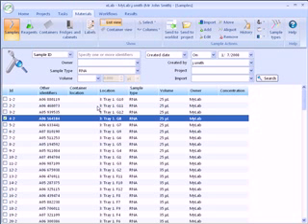To create a new sample, we have two options. We can add them one at a time, or we can import a batch of samples from an Excel file. Here we will add samples manually. To see how to import a batch, view the import tutorial.